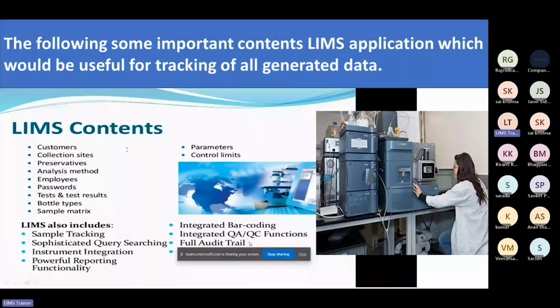Right. So all that data will be available in this particular software. Whatever the requirement is, like an auditor wants to know who logged into this particular system on this date at this time, that data will be available in the LIMS software. Okay.